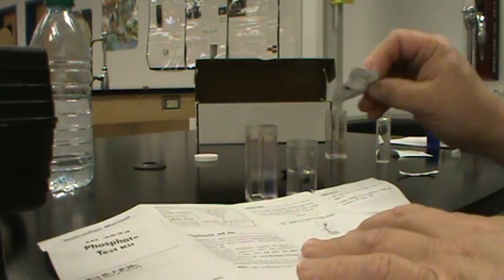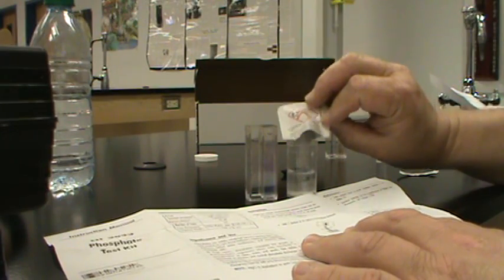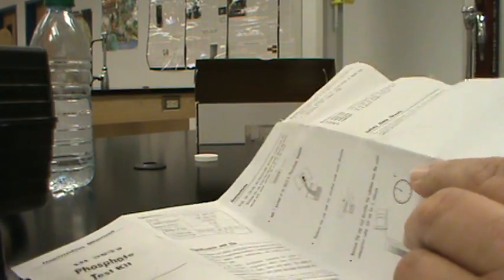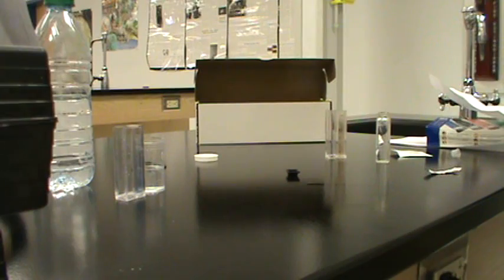Our instructions say that we're going to add the phosphate pillow to the water until the solids dissolve, and we're going to swirl just like this because we don't have a cap. We're going to swirl this around until most of the solid parts dissolve. Then it says we need to wait for one minute. I'm going to stick my hand over that, shake that really good, get those solid particles dissolved as much as possible. We're going to wipe that clean and now we're going to leave this. We will come back to it in just a moment.